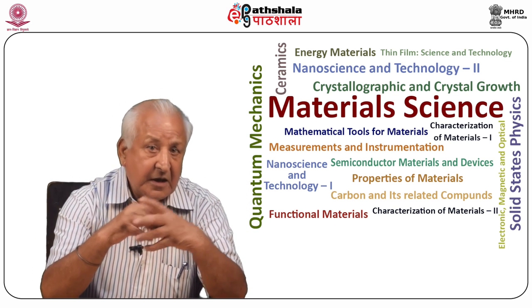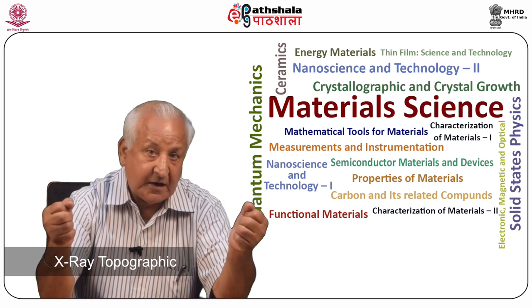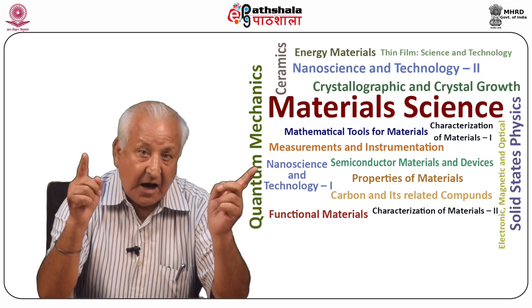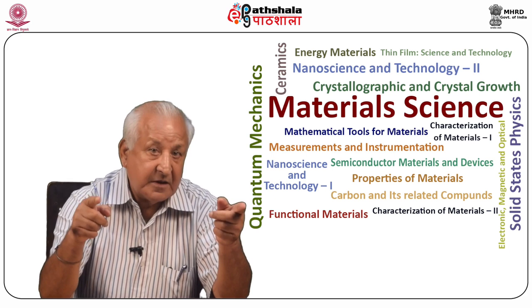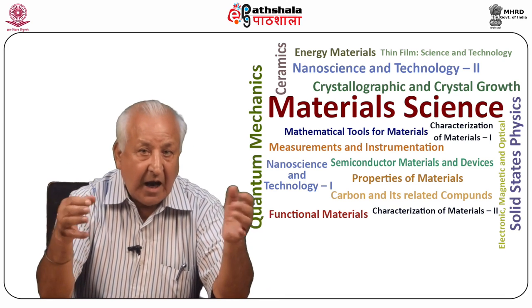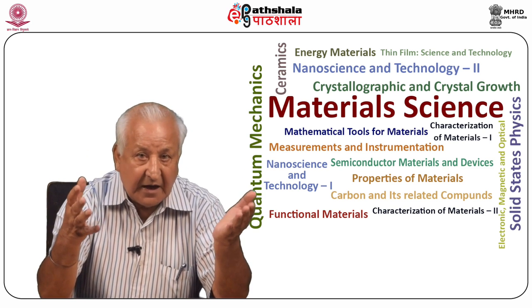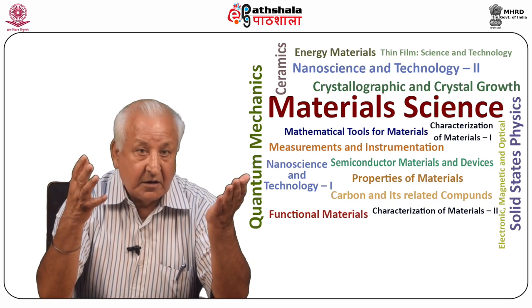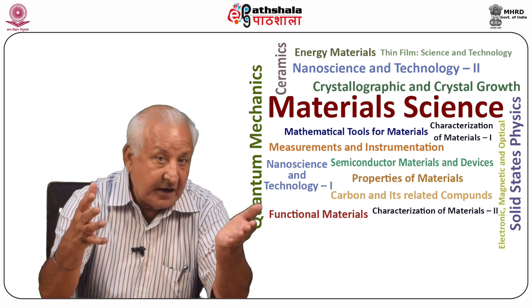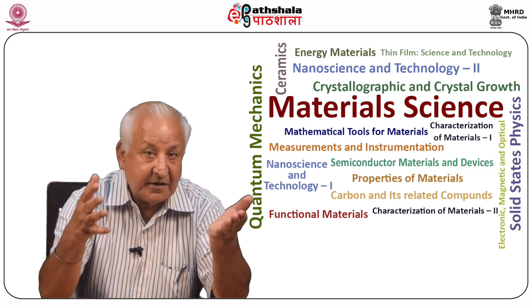Advances have been made in recent years to improve the efficiency and sensitivity of X-ray topographic experimental techniques. Using a high brilliance and high power source, the exposure time is greatly reduced. X-ray generators of the rotating anode type have been used with great success. This type of generator with electrical power of 30 kilowatt is available. Synchrotron radiation at a wavelength of 1 angstrom has the potential for a great future in the field of X-ray diffraction topography.